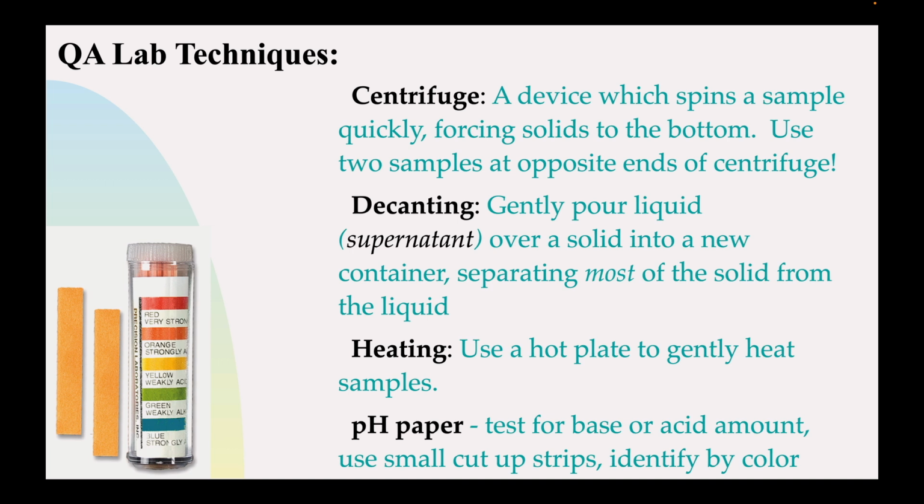The pH paper will turn one of the colors you can see on that little container. Generally, red and orange are seen as very acidic. Green and blue are seen as basic. Usually these tests are just to know if you're acidic or basic. So if you're red or orange, you're definitely acidic. Green and blue, definitely basic. Anyway, I'll show you examples using all these things in a video pretty soon, but this will give you a heads up as to what's going on.